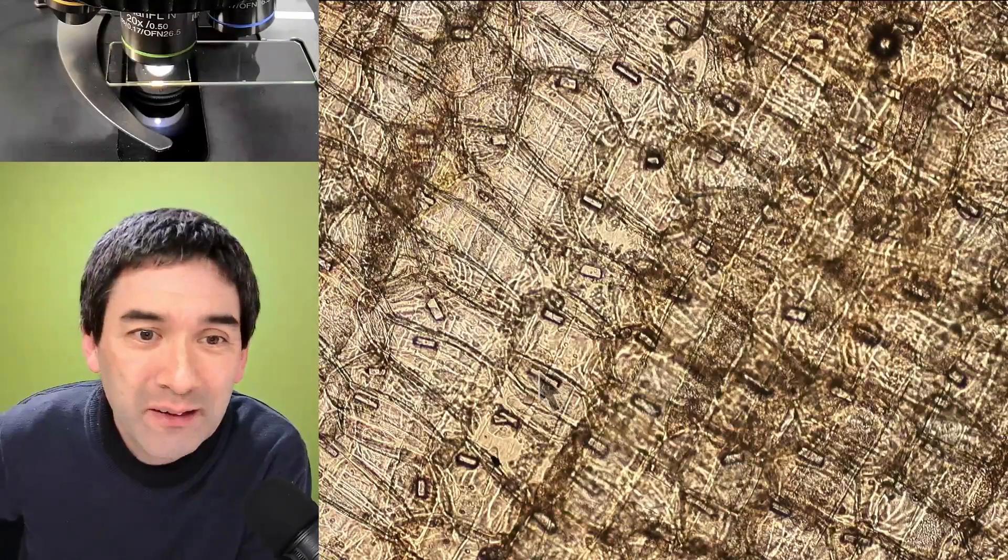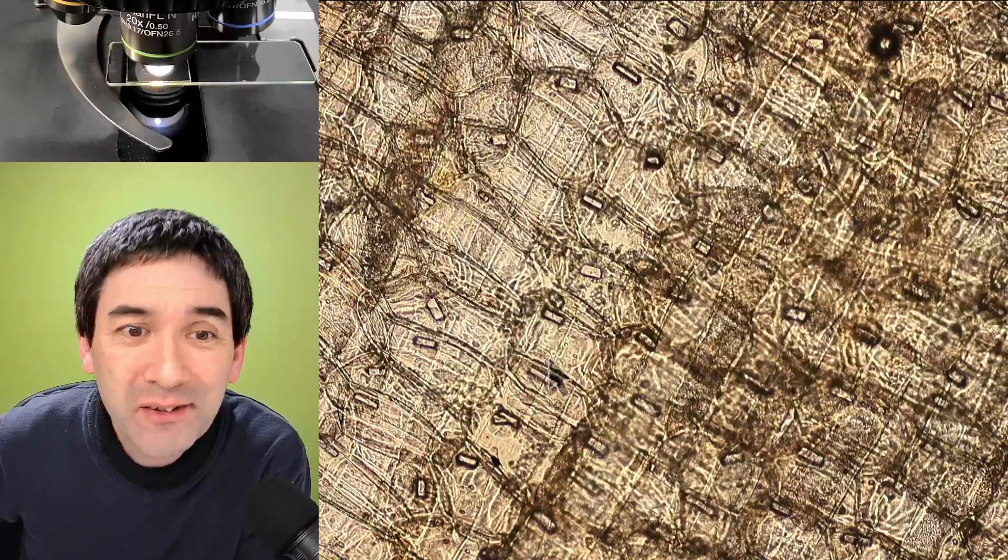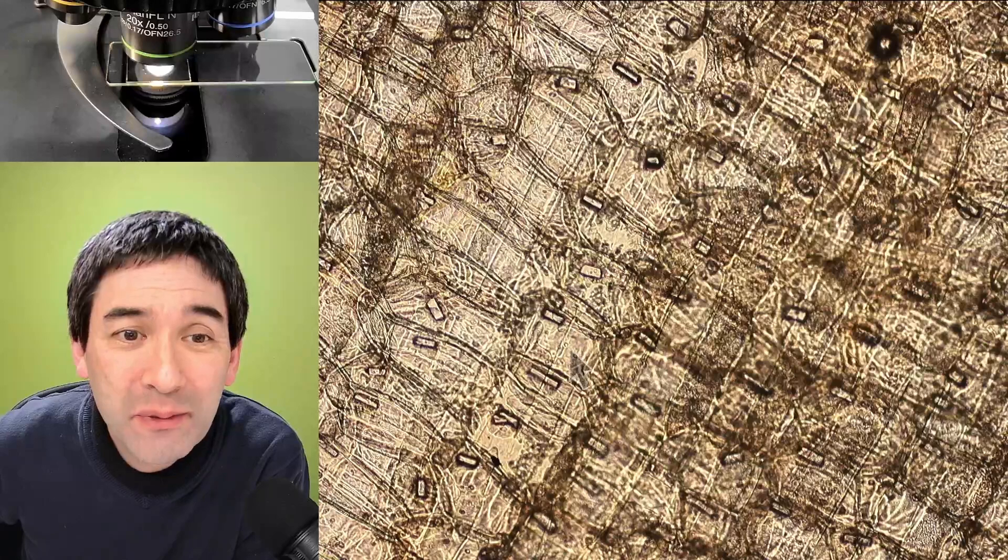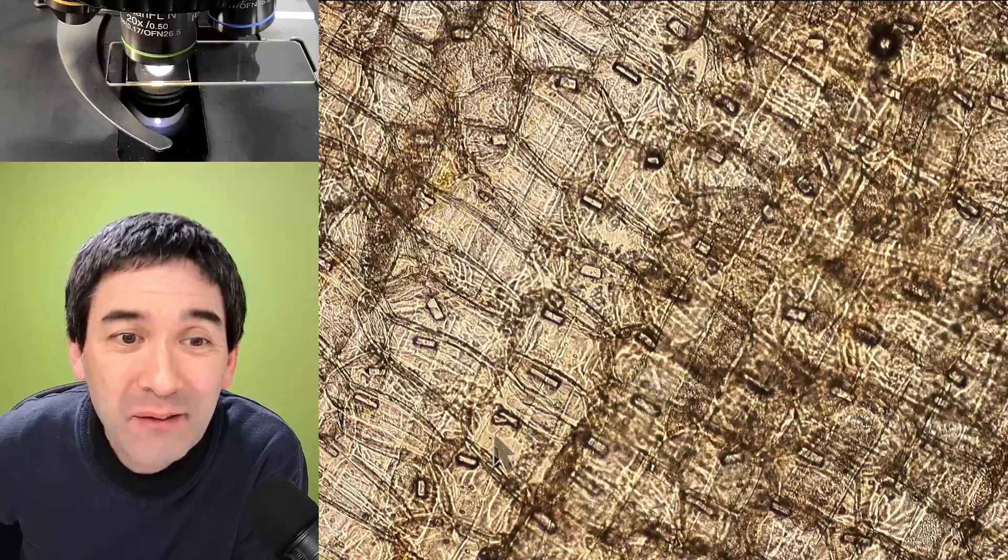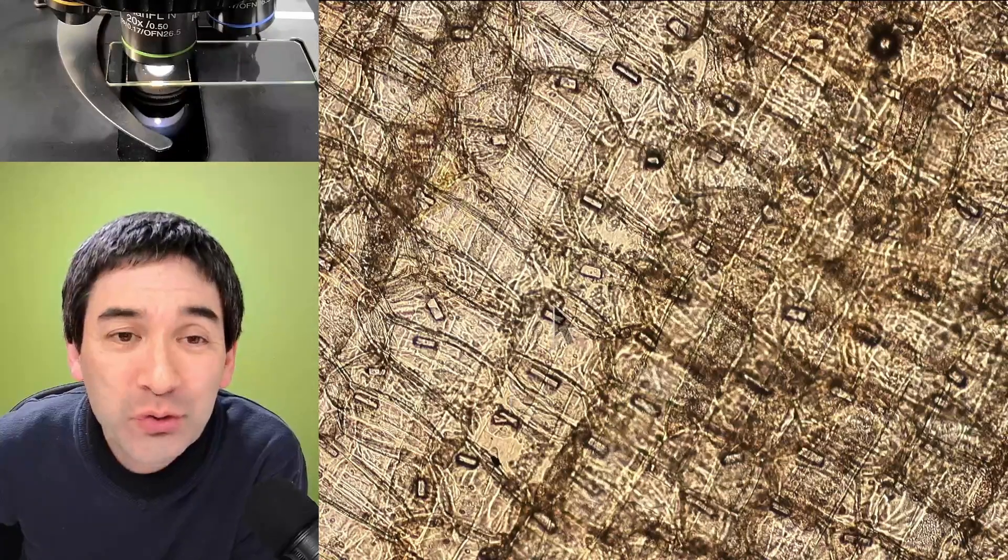Yes, this is a regular bright field and you can already see the individual cells here. The cell walls are quite nicely visible and many of those cells have those calcium oxalate crystals in them.